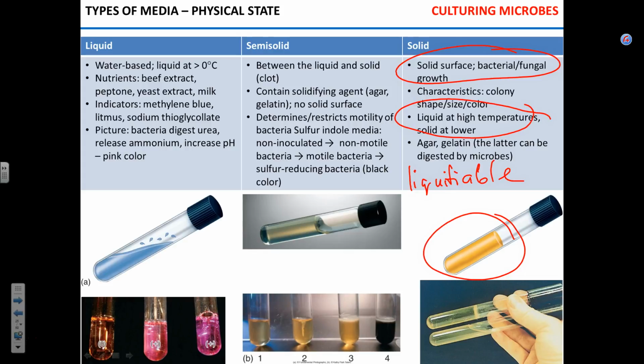And then you put it here and you wait. And when you can touch it with your bare hand without burning your hand, not that you can hold it comfortably, but you can do pretty much this, it's time to pour the agar into the plates. You gotta move quickly because it starts to solidify. Actually, you can pour it when it's hotter. We did that because we added antibiotics, so you have to let it cool down so the antibiotic does not die. But you can just pour agar in the plates, leave them on the table, they will solidify with time, and you got your plates.